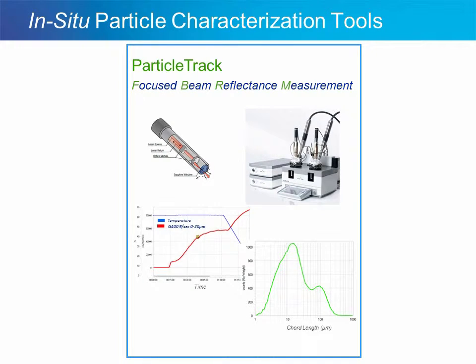And it's especially suited to tracking flocculation processes because not only does it track changes in particle size, but it also tracks changes in particle count. So it's a very sensitive and precise measurement of how particle size and particle count is changing. In a flocculation system, a large number of small particles stick together to make a small number of big ones. So we have changes in the particle count, and we also have changes in the particle size for a flocculating system. So the tool is very well suited to tracking this.